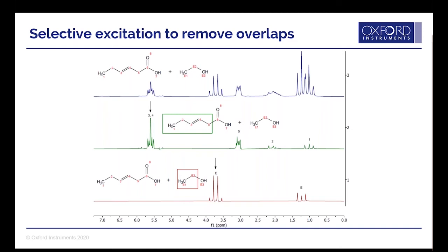And what that allows us to do is that although many of those peaks were already separated in the top spectrum in blue, the methyl groups were significantly overlapping, and this allows us to separate those out and analyze them independently. And that is a real advantage when it comes to the flexibility and the usability of benchtop NMR for analyzing things in 1D or just with proton.